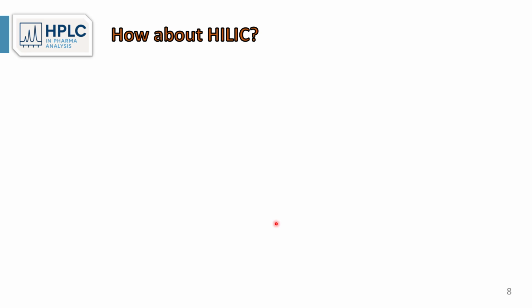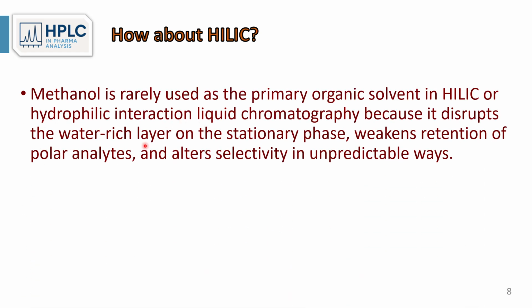How about in the case of HILIC? HILIC stands for hydrophilic interaction liquid chromatography, which is an emergent mode, which is becoming popular for its separation of polar analytes and polar drugs. Now here, methanol is rarely used as a primary organic solvent in HILIC because it tends to disrupt the water-rich layer, which is required in HILIC on the stationary phase.